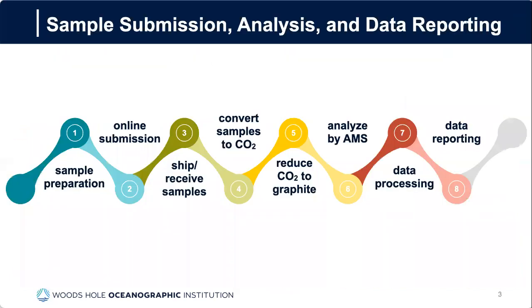For this presentation, I broke down the general process from an outside client preparing and submitting samples to us for radiocarbon measurements, to our processing and analysis of those samples, and then the reporting of the data. So I'm going to go through these steps briefly and give some hints and things to think about if you're submitting samples to a facility for radiocarbon analyses, as well as some details about what we do with those samples and the data we generate.